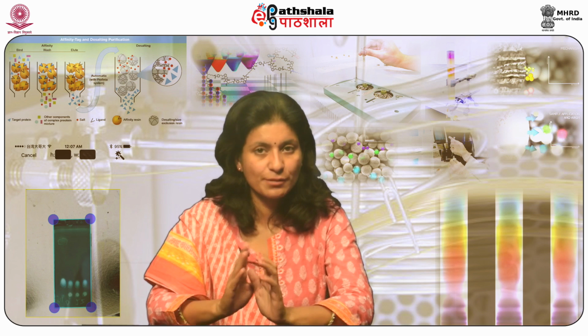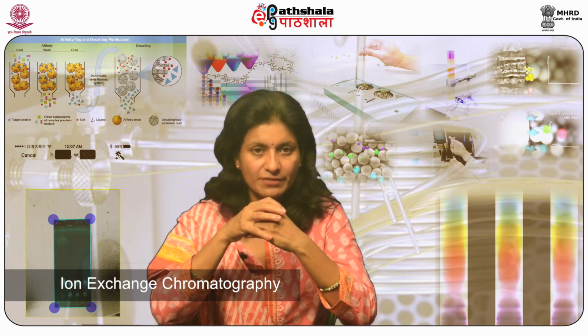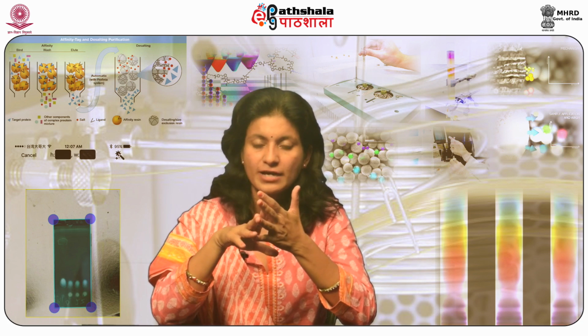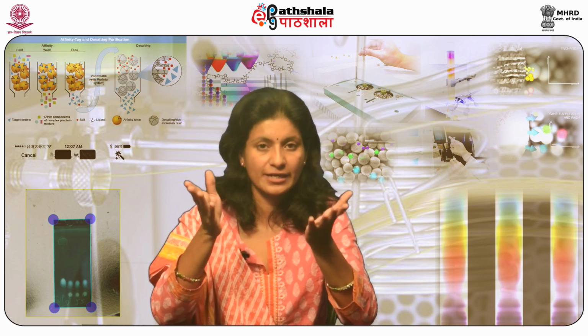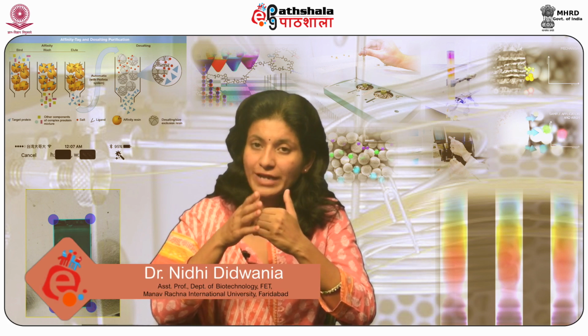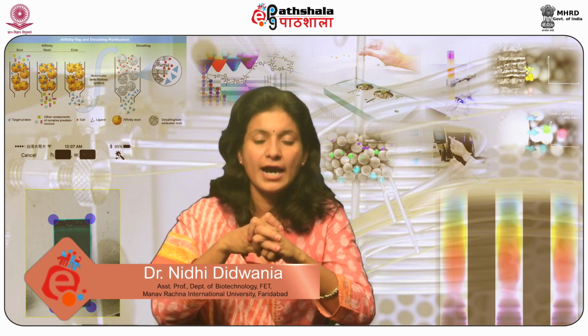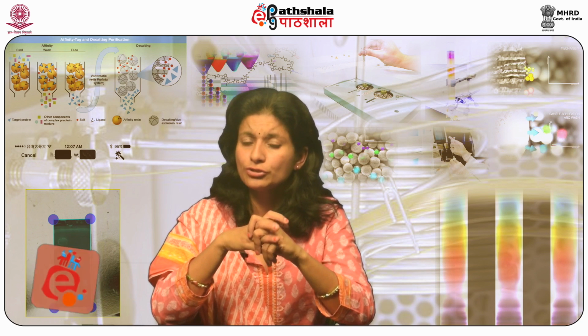So students, let us summarize what we have learnt in this module. We can see that there is an unlimited scope for ion exchange chromatography. It is very helpful in qualitative, quantitative, as well as trace and ultra-trace analysis of compounds. There are a wide variety of applications of IEC in different fields like pharmaceuticals, food, flavors, fragrances, environmental analysis, forensic science, etc. Ion exchange chromatography has numerous advantages and a few disadvantages.